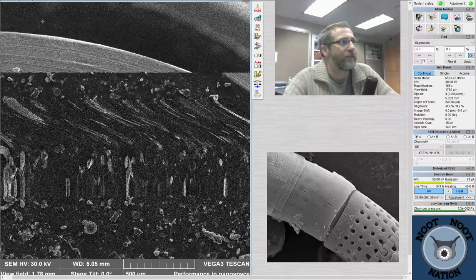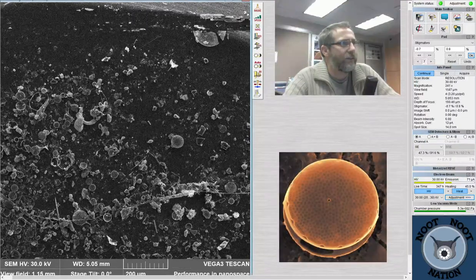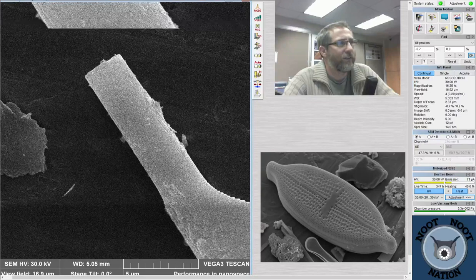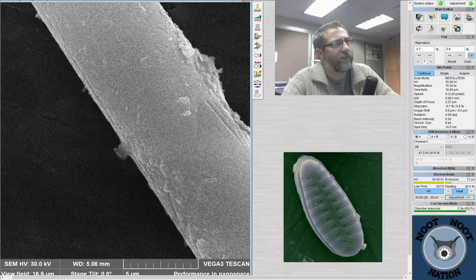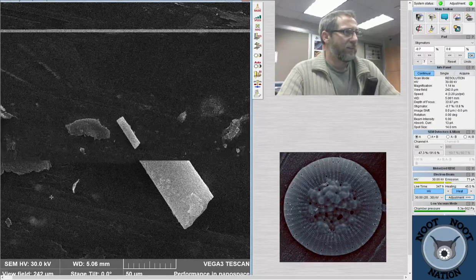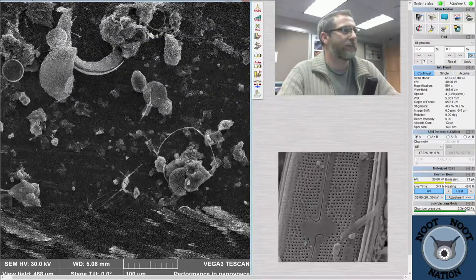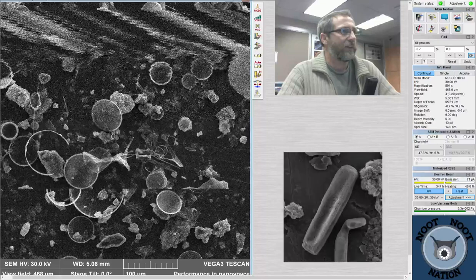Is that a Cirrorella? Oh no, it's a piece of a Coscinodiscus. Some little tiny piece of something here. I wish I knew what that was. I can't tell if it's a piece of a diatom or a little colony. Could just be a broken piece of a sponge spicule, I guess. It would be nice if we found another Skeletonema just kind of hanging out in here. We've kind of been looking at stuff at the very large scale, and so sometimes we miss some of the little guys hanging out in the spaces between.